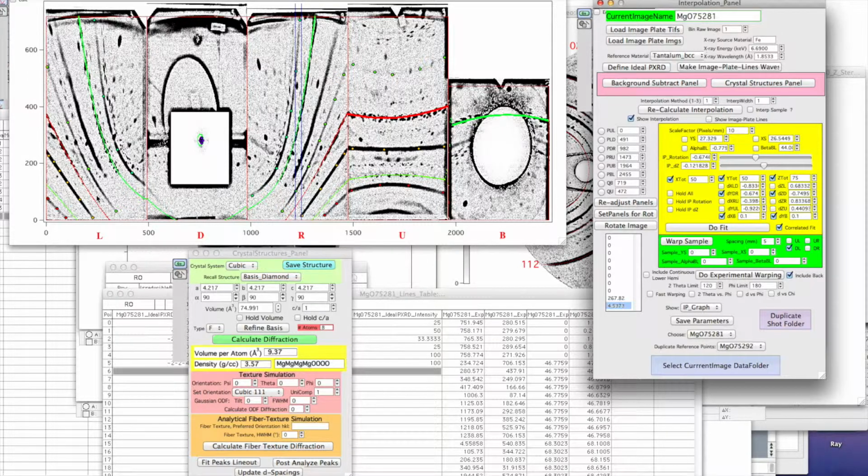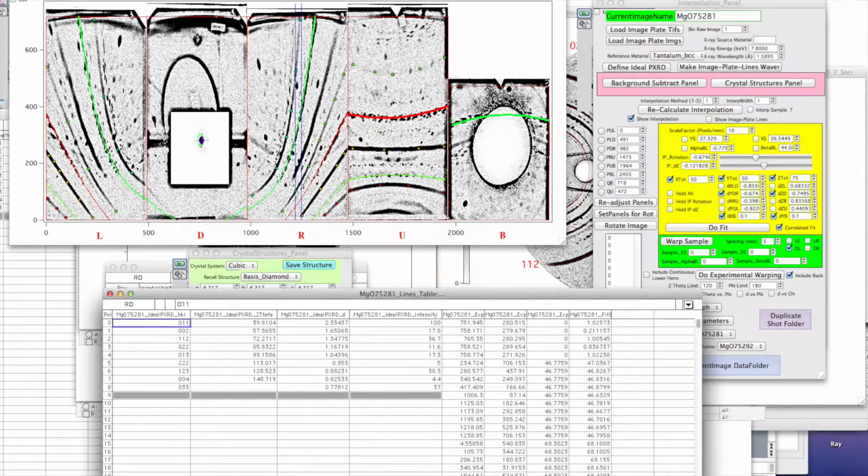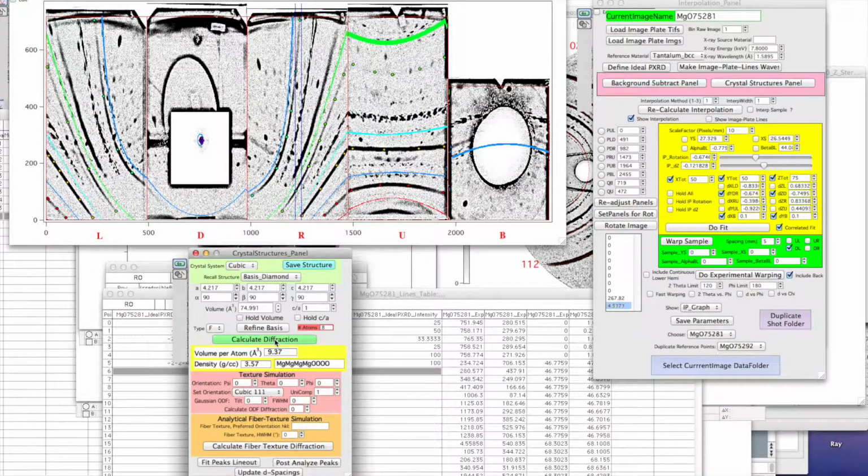It's 7.8. 7.8, okay. So we just press 7.8. So what was iron? I can pull up... Okay, I'll find it. Then we just put in Fe, right? Yeah, right. Okay, 7.8. Then you need to recalculate. Yeah, could be. This line here has not come up. So you also have the iron spectrum.